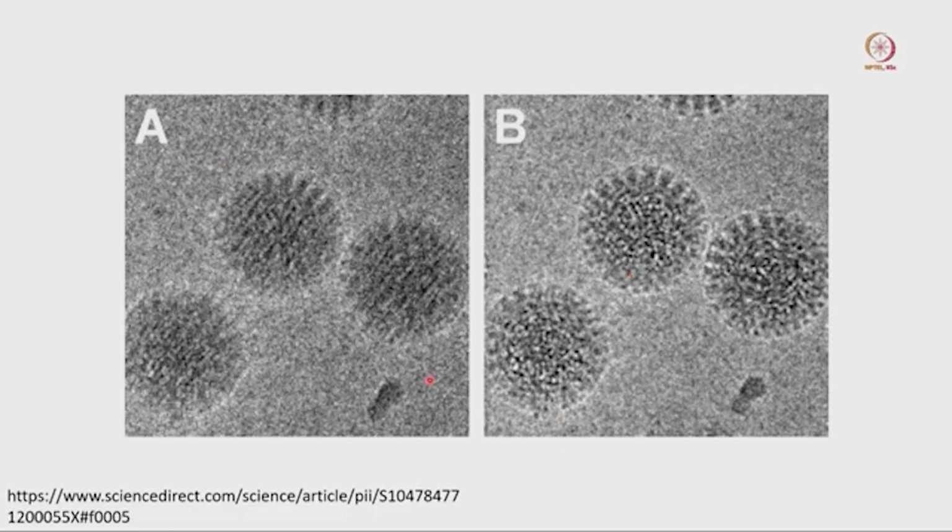and this is an image after drift correction. So this particular image is without drift correction, and we are making an integrated image. When we have an integrated image, you can see that there is some kind of motion, and many features of this virus are not very clear. There are lots of line-like patterns we can see in all the virus particles.